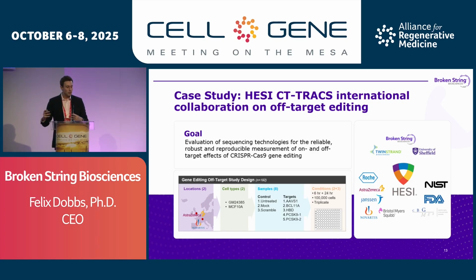We measured a range of different guides across this, which are common reference guides, including the BCL11A guide that went into the Casgevy product as well. And the goal here is to really benchmark the activity of these different guides with the technology and compare things like reproducibility and sensitivity across these experiments.